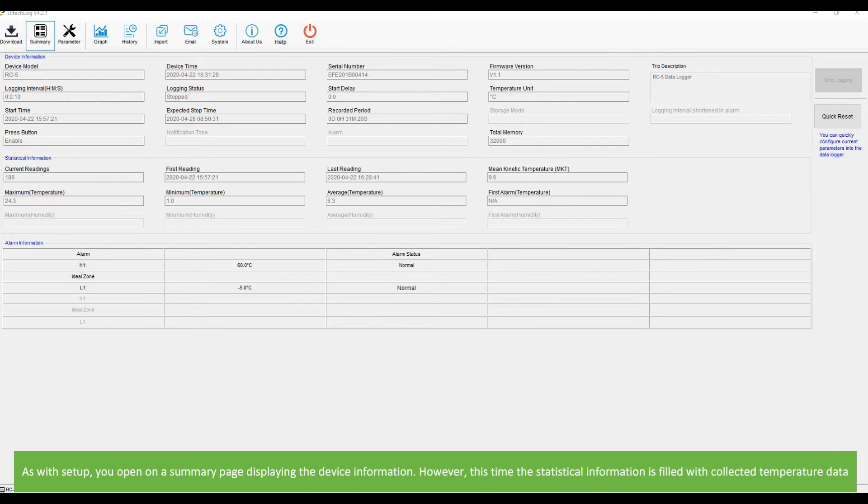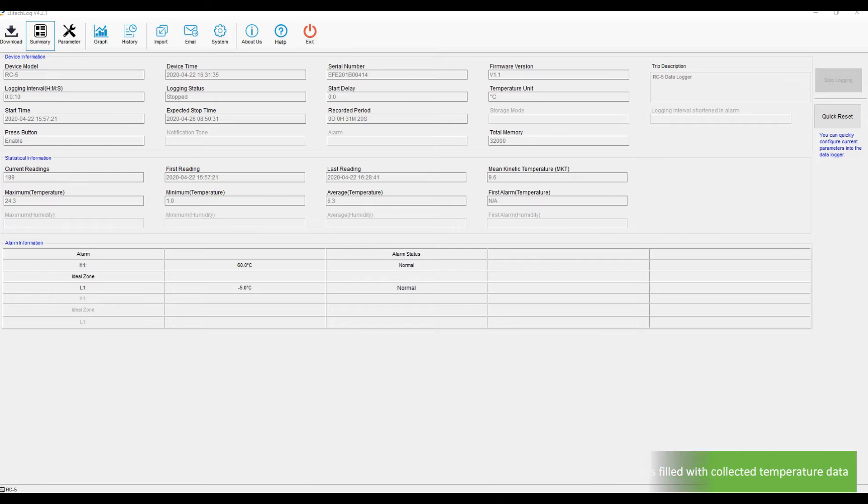As with setup, you open on the summary page displaying the device information. However this time the statistical information is filled with collected temperature data.